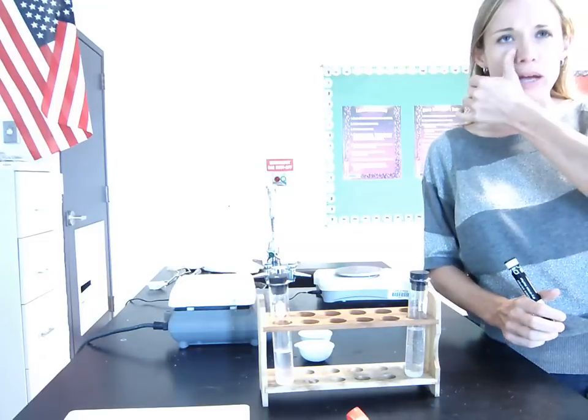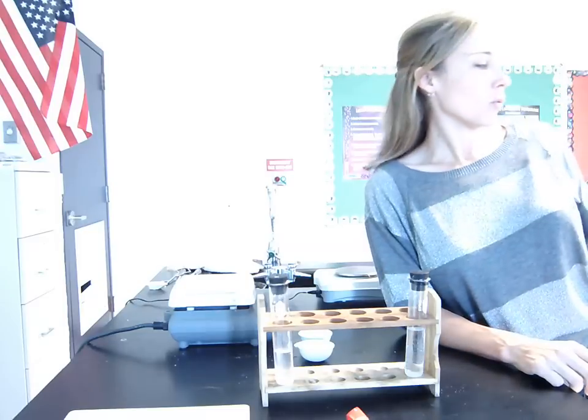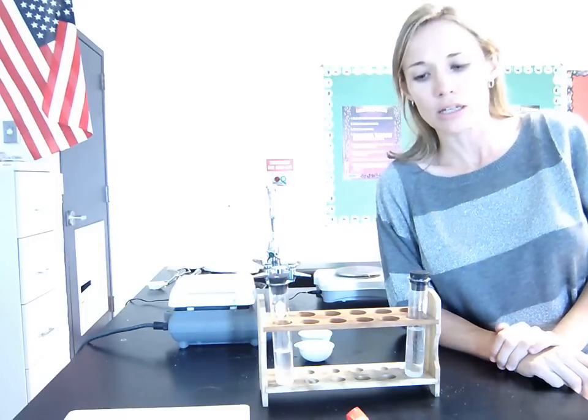It reminds me a little bit of when we did the density of a gas, because we couldn't measure the gas directly, so we had to do all these other things in this roundabout, indirect way to get to the numbers. So that's kind of like this lab today. When I show you the data, you're going to see we're taking all these different measurements really just to get to two numbers, one main number at the end, but two numbers that we'll use in a calculation at the end.